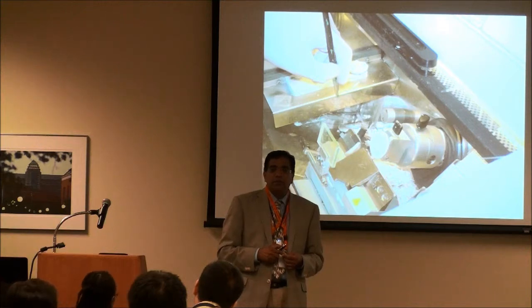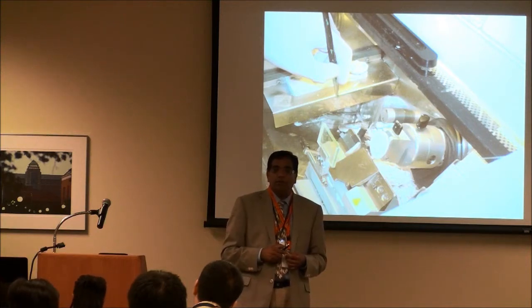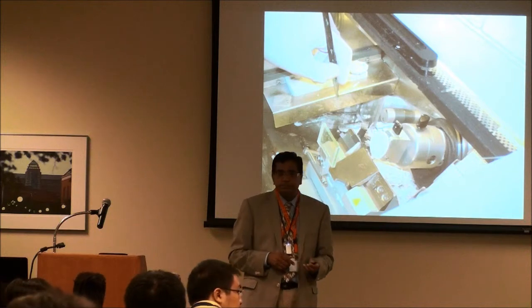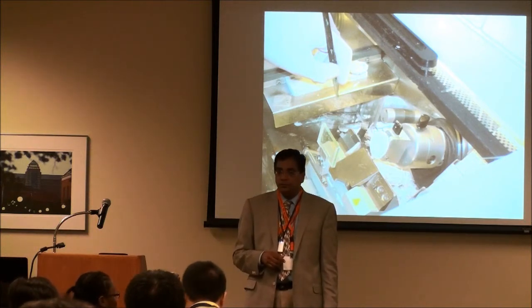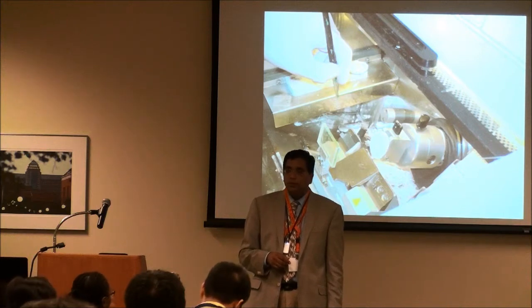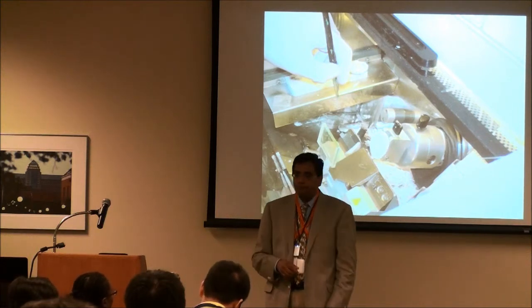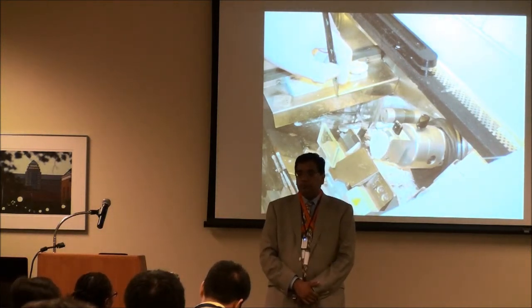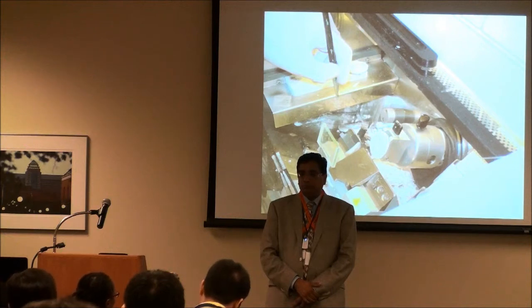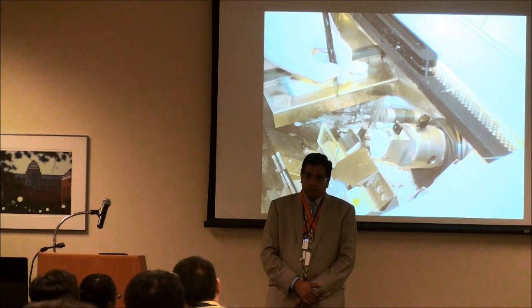Professor Wang at Washington University gave the presentation about recent developments in photoacoustic tomography. Maybe I missed something, but it seems like what you're doing with the frozen section, he can do with live tissues in color.